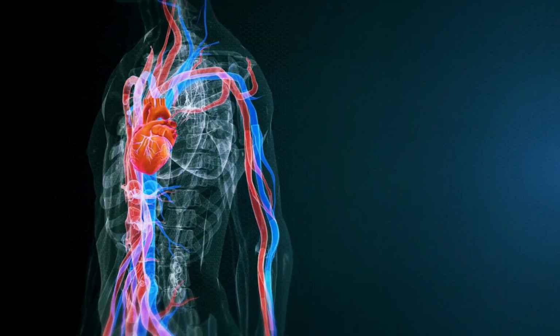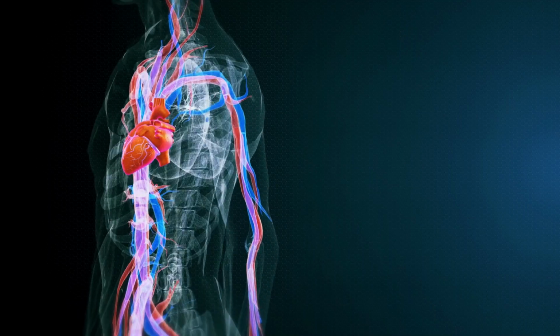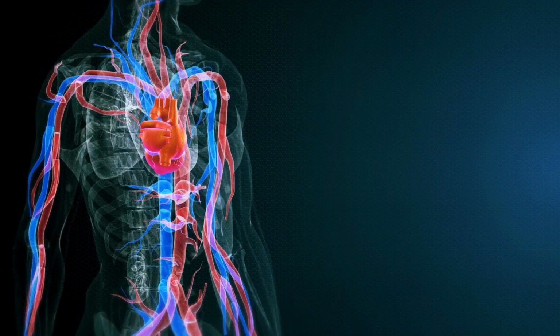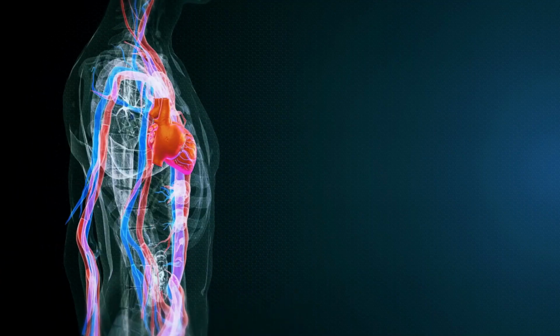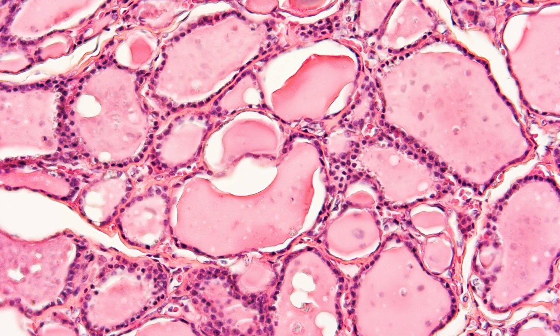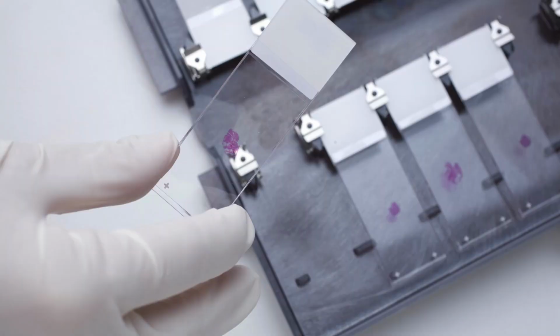D. Silver staining. Silver staining is a technique that utilizes visualization of certain features of the cells and tissues, particularly those that are poorly visualized with conventional stains. This method is based on the conversion of silver nitrate to metallic silver, showing in the tissue as deposits that are either brown or black.